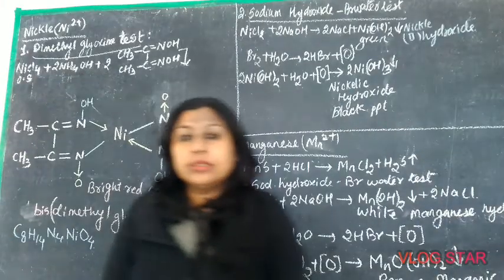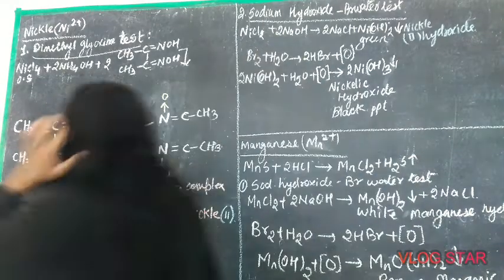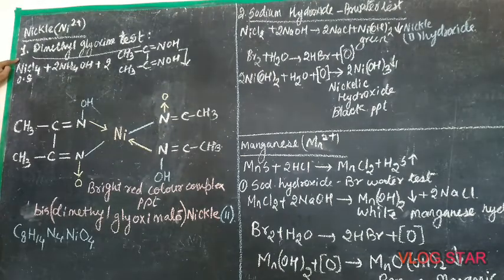Now children, the test for nickel, Ni2+. First is dimethyl glyoxime test.